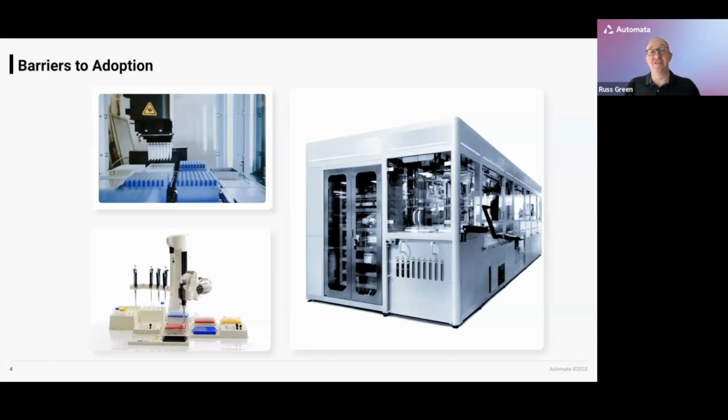There's probably more successes than failures in this space, and I speak as someone who comes from a very liquid handling centric automation background. But if we either go for something too complex in the top left, or something less complex than we actually need, then we end up having these systems sort of gather dust on the side, and they gain a very bad reputation as a result. So I think there's a lot of psychological challenges about adoption of automation that are very generalizable in this space.